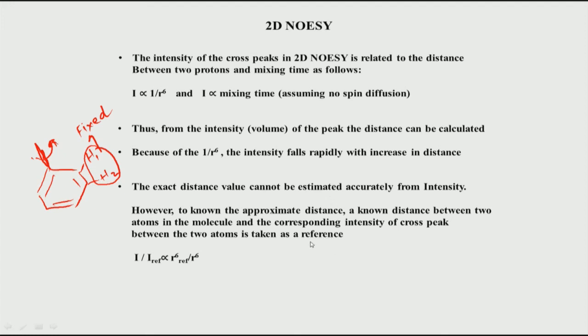So, similar to what we do in case of TMS, remember in NMR everything is with respect to a reference. There is nothing like absolute things in NMR, everything is relative to something which we call a reference. So, therefore, here also we use a reference. Now, this is one option.